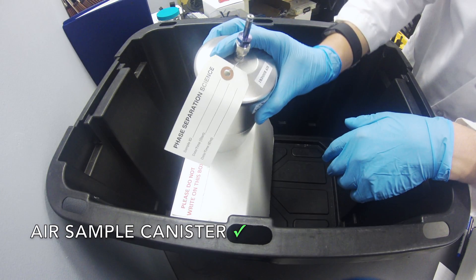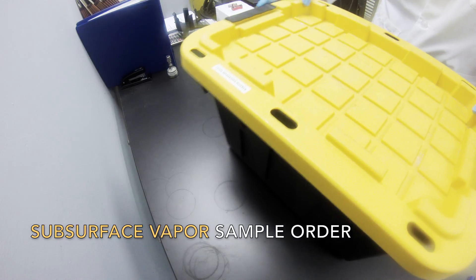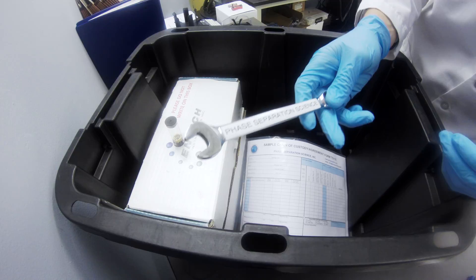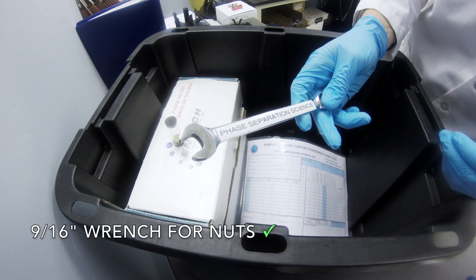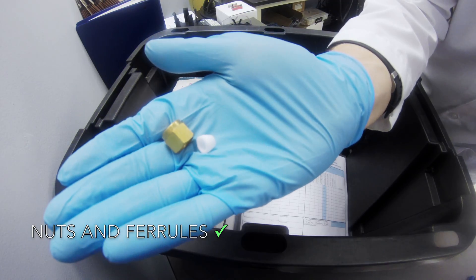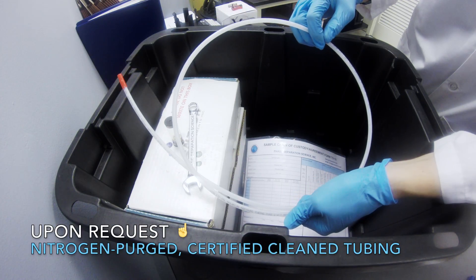The second type of air sample is a subsurface vapor sample. In addition to the components for an indoor air sample, you will also receive a 9/16 inch wrench, nuts and ferrules. If requested, you will receive nitrogen purged certified clean tubing.